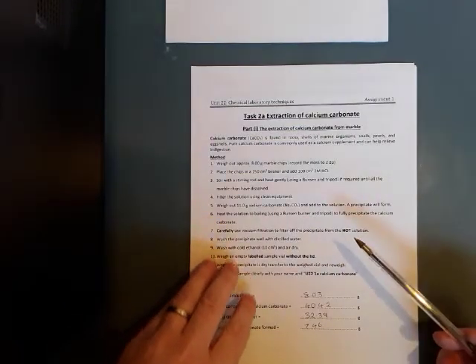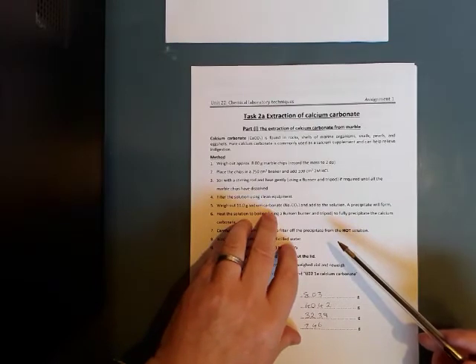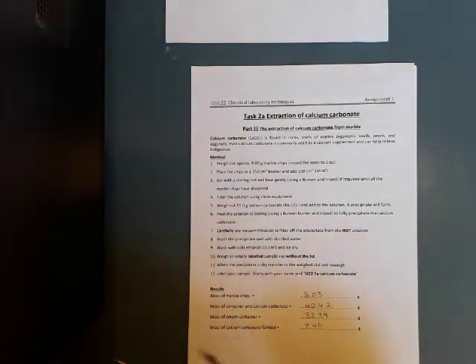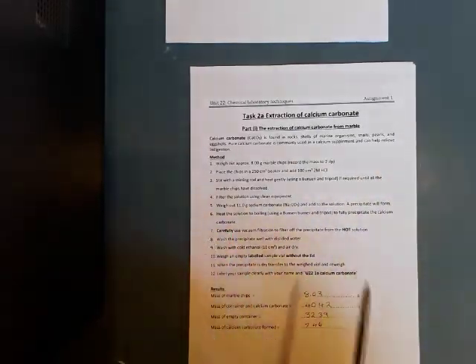Then we're going to be adding our sodium carbonate to the solution after we've filtered it. Basically it's a displacement reaction that we're getting here. So the sodium is going to displace the calcium and reform calcium carbonate. Now, again, it's saying a precipitate will form. We heat the solution by boiling to fully precipitate.